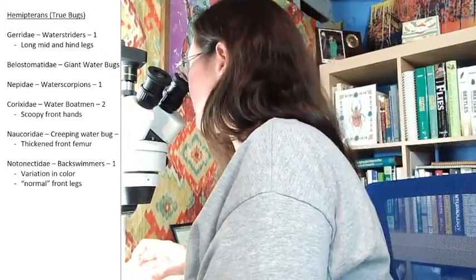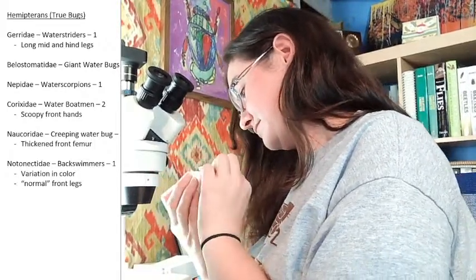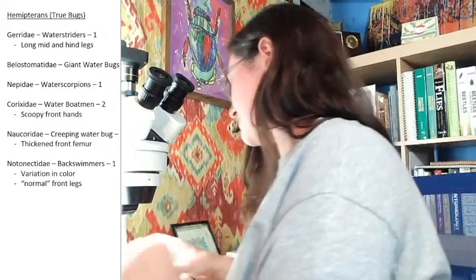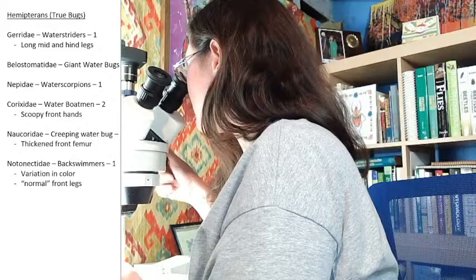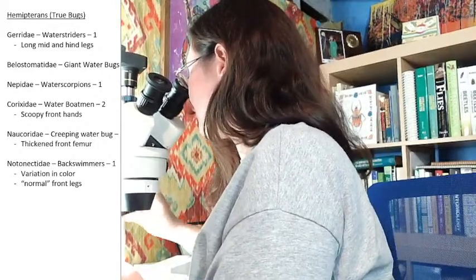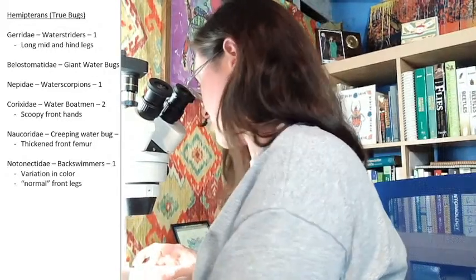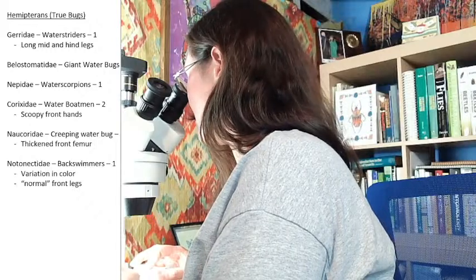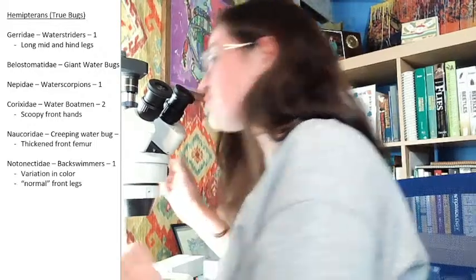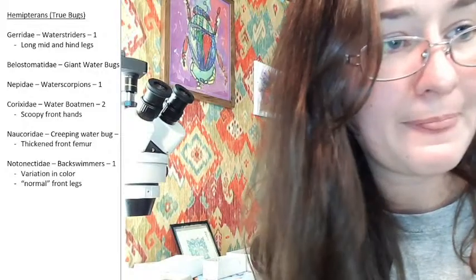He's pretty small. This guy was collected in Jackson, Michigan for one of my collections because I was looking for an insect in a small family. I was in the process of making a collection and I just needed a couple more unique families. So I pinned this guy.